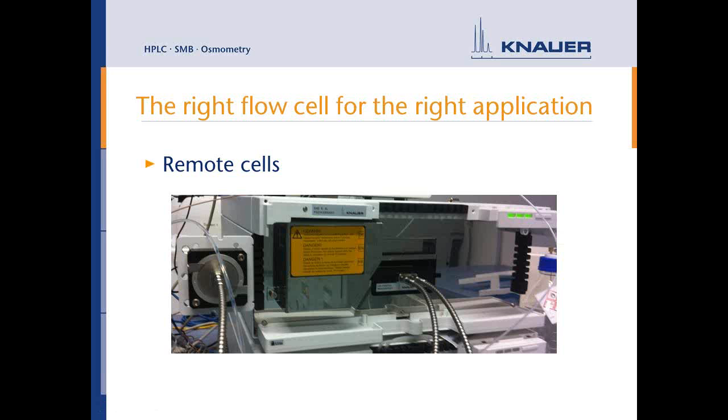Yeah, and when we spoke about the preparative flow cells, on the right-hand side we spoke about remote. The type was remote. And this is just a photo of the DAD 6.1L that we've got in the product management lab. You can see here, in the center of the picture, there is the so-called fiber optics adapter. This adapter can then be connected with the fiber optics, so they flow, unfortunately, out of the picture, and then they come back onto the left-hand side, flowing into the flow cell.